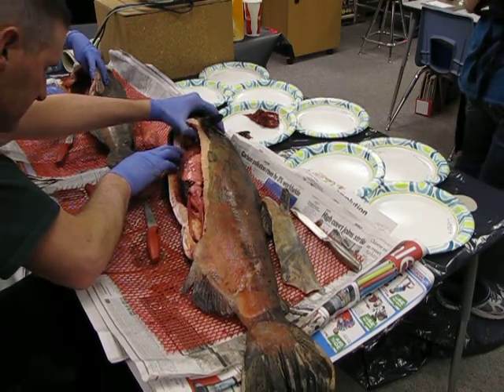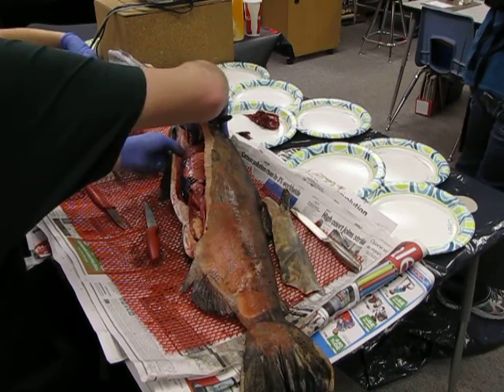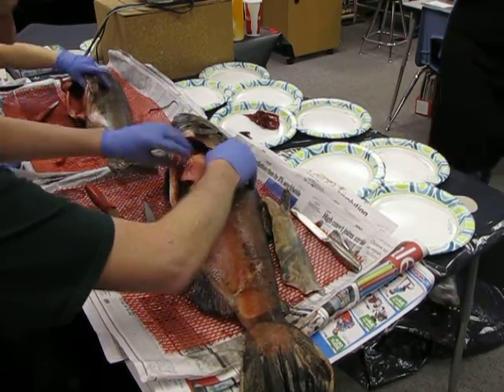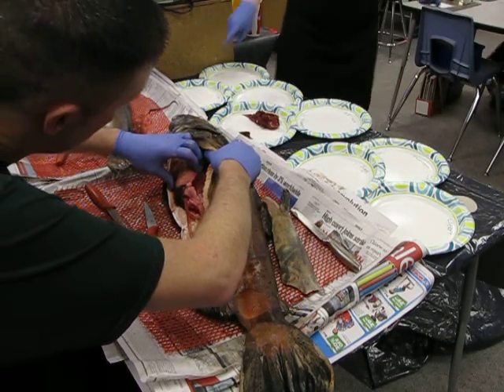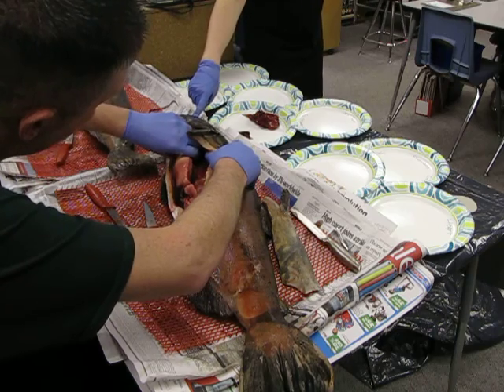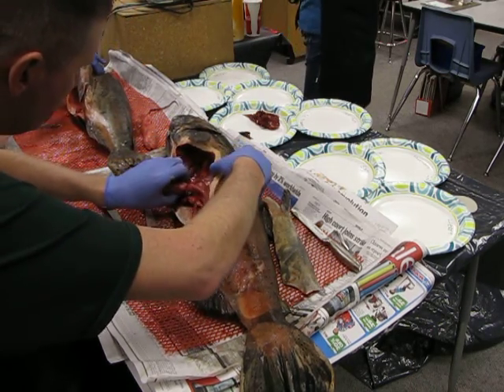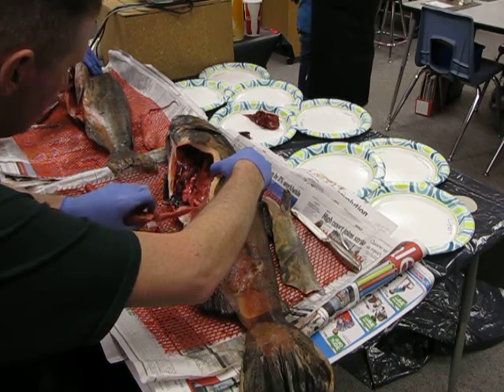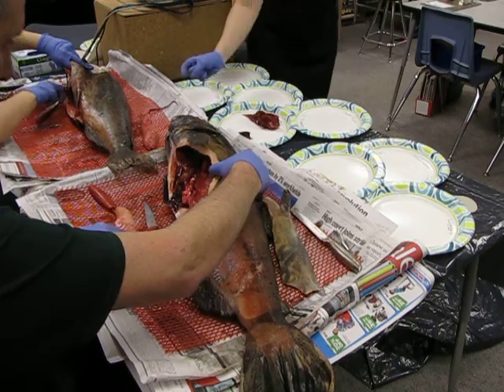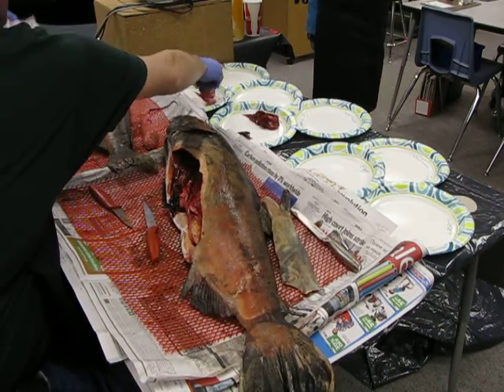Do you remember what helps them smell? They have something like nostrils, and we call them nares. Can you say nares? Nares. Nares. Now you can see on this one right here, between the eyeball and the tip of the nose, there's a little hole right here. And I'll hold it up again so you guys can all see it in a minute. But when the salmon are in the water, that water is moving in and out of those 2 nares on either side of their face all the time.